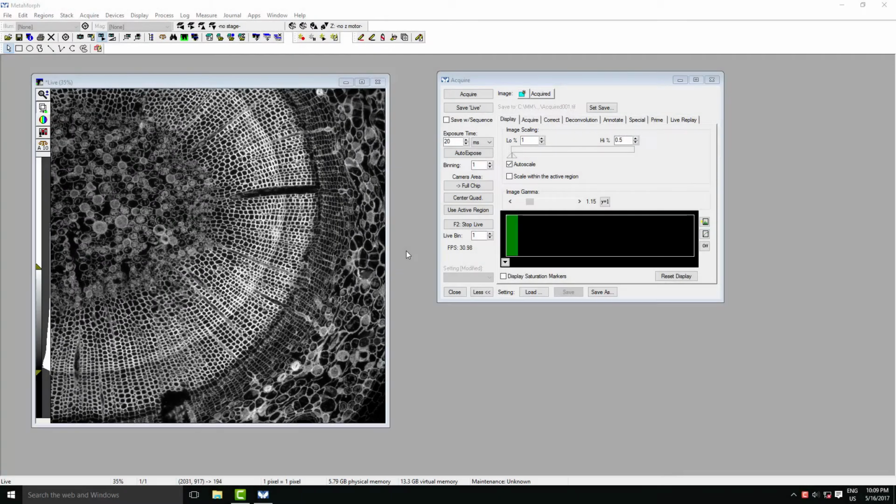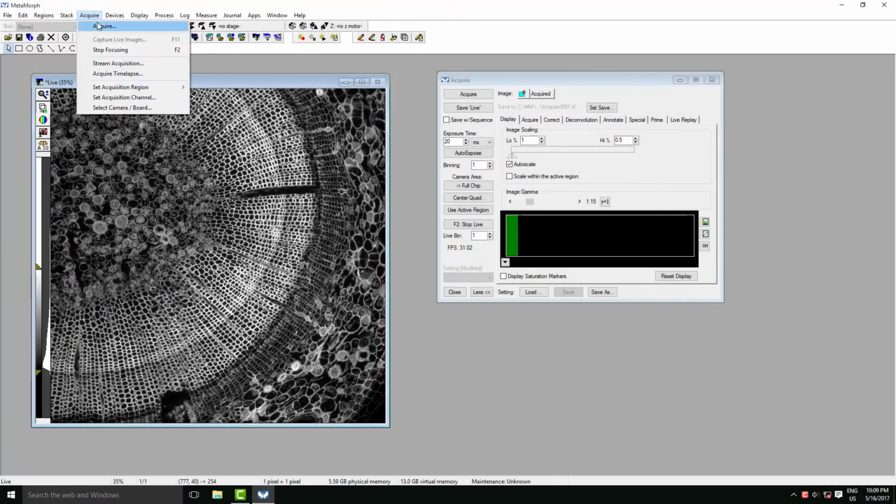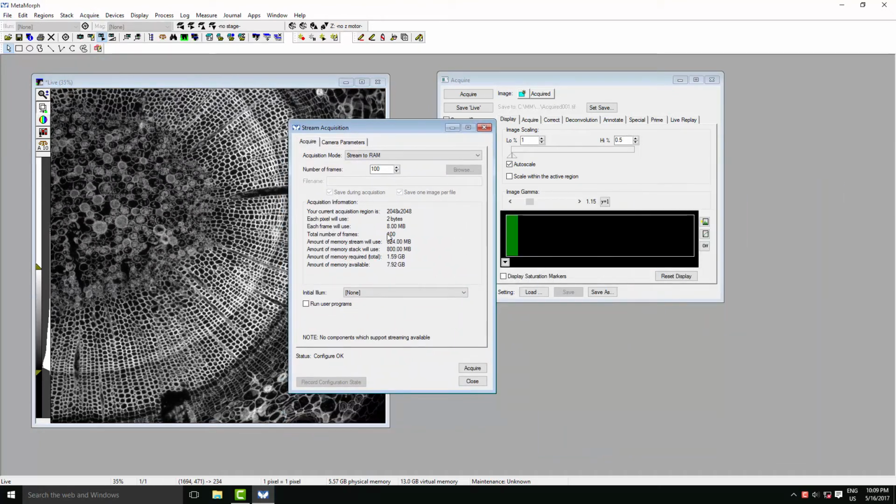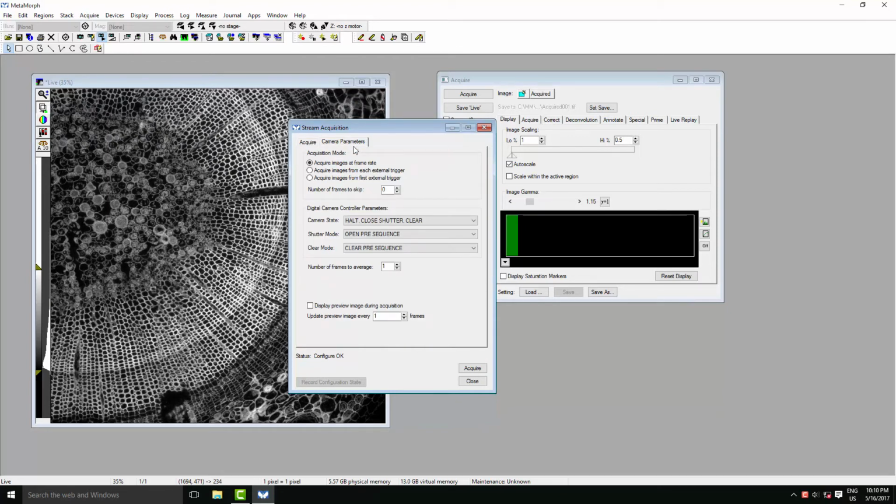Now we'll have a quick look at taking movies and time lapses. So you take a movie by going to the Acquire menu and just choosing Stream Acquisition. Here in this window you can specify the number of frames that you want to record, and whether you want to stream to RAM, which is faster, or stream to hard disk, which will allow you to take a longer movie. Here you specify the file name for if you're streaming to hard disk. But we'll stream to RAM right now. If you want to preview your movie as you go, you can choose Display Preview Image during acquisition. But we're not going to do that because it can slow things down a little bit.